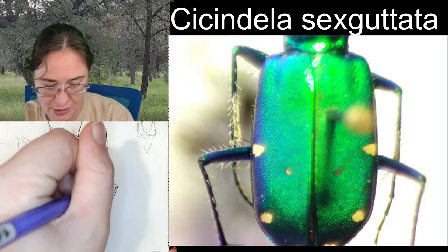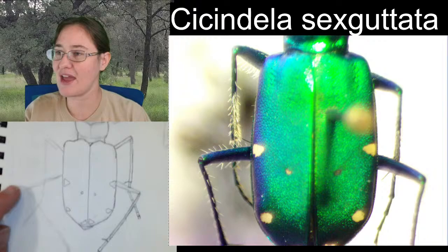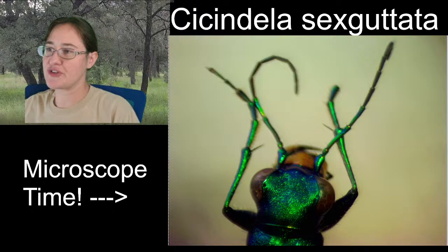So let's see, this would have been one coming out right about there. One, two, three, four, five, and the tarsal claws. So right about like that, we've got a middle leg and we've got a hind leg. So we're going to be going up. Keep in mind that now our front leg does not have all five tarsal segments, unfortunately. They lost a toe or two, or four it looks like. But we've seen these legs over and over when we saw the middle and the hind leg, so it's going to be generally the same idea.